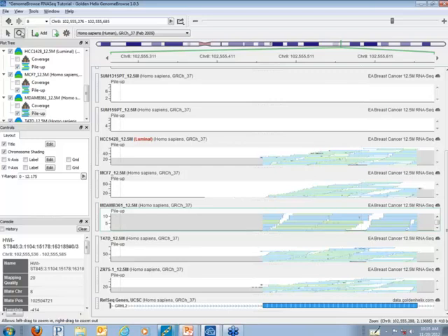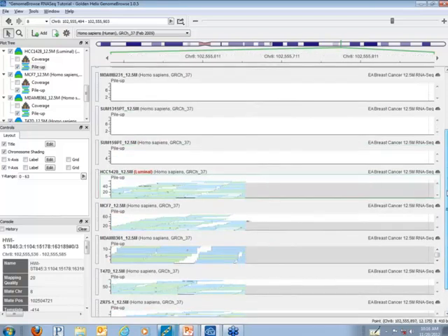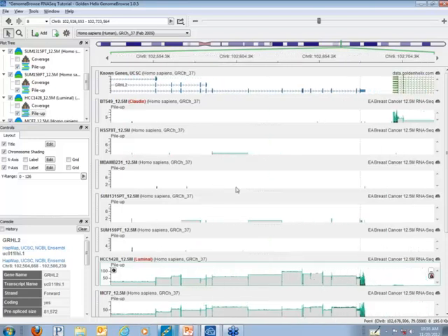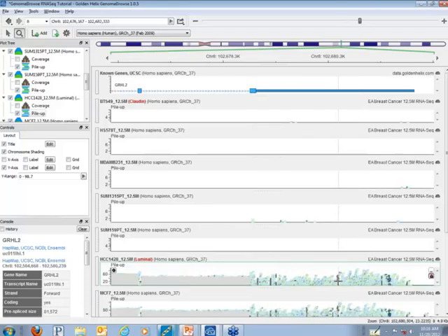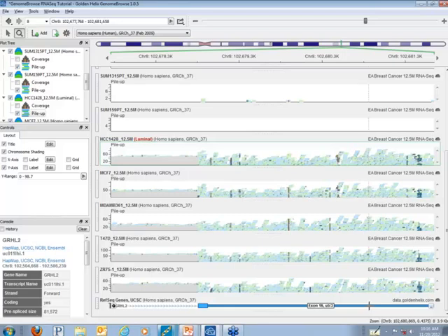And let's actually scroll a little bit to the right some more. We do have some more variants. This region here. Zoom into the very end of the gene, and we can definitely see that there are a lot of interesting variants going on in the UTR3 region of this gene. Now let's go ahead and switch back to our presentation.